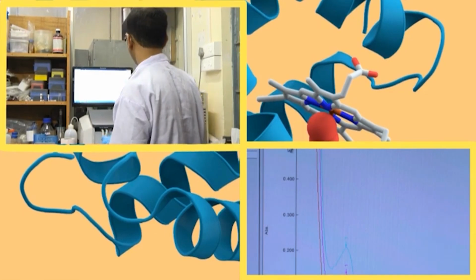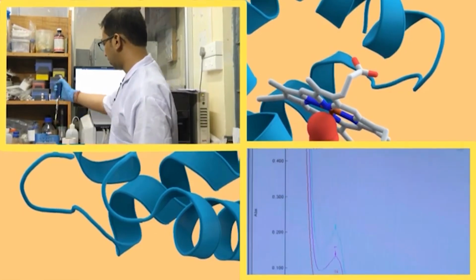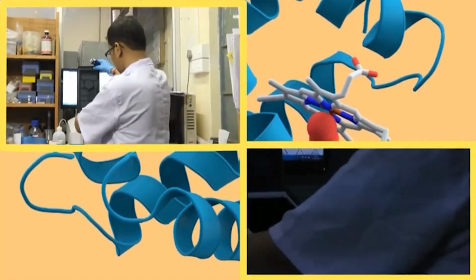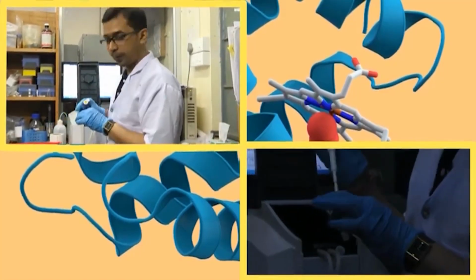Now, this was for 15 and we will again add another 5 to make it 20.